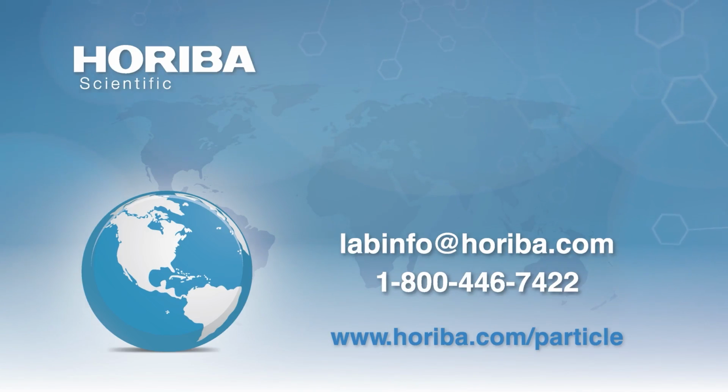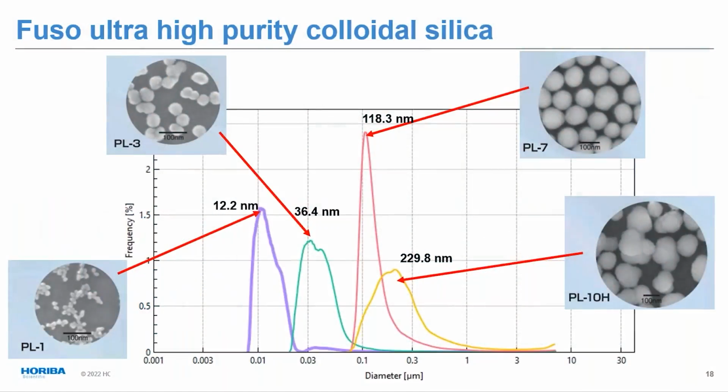Can this tool separate the primary and secondary particle of the Fuso abrasives? So are the PPS and MPS you showed in the last slide measured by this tool? Yeah, that's how we actually measured them. Now, you may remember from that slide that there was actually a fair bit of overlap between some of the sizes. These were the individual particles measured all by themselves. This is not a mixture of 4 different things in one cuvette. This is each one being measured separately.